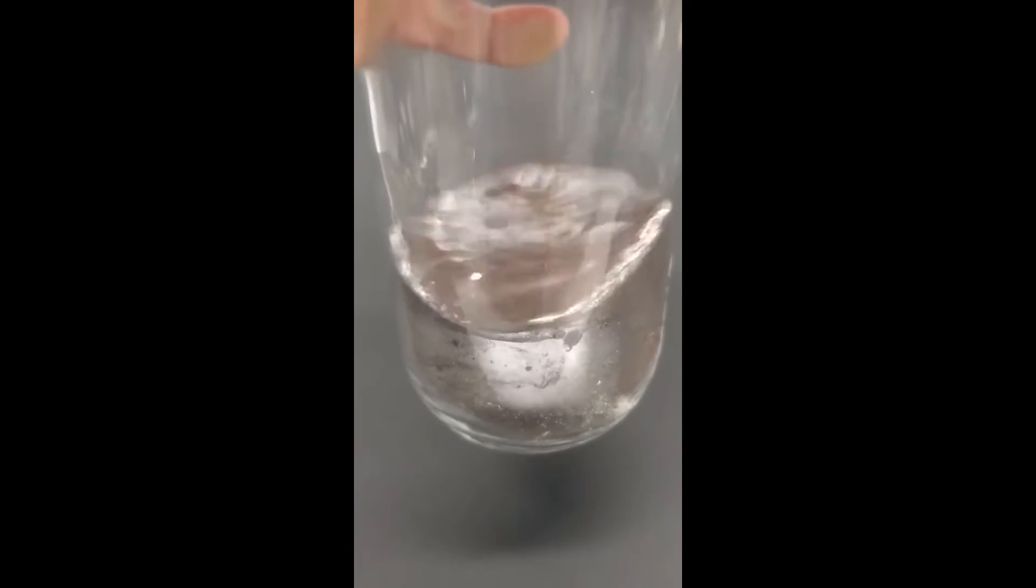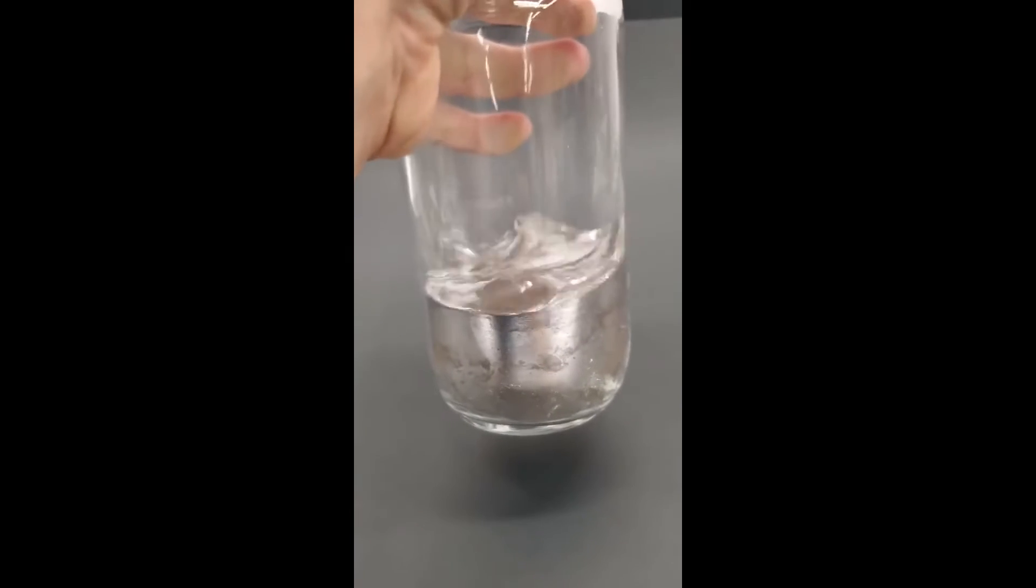Mercury is the only metal that's a liquid at room temperature, and something that I've always wanted to do was to try making it solid.